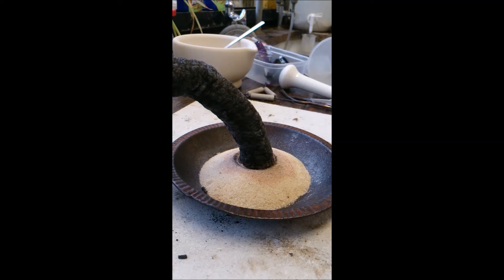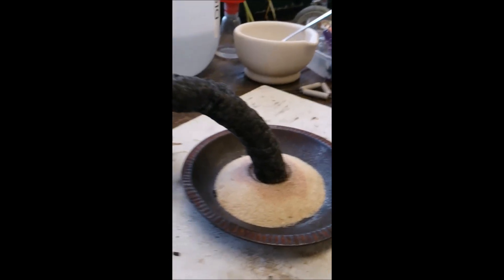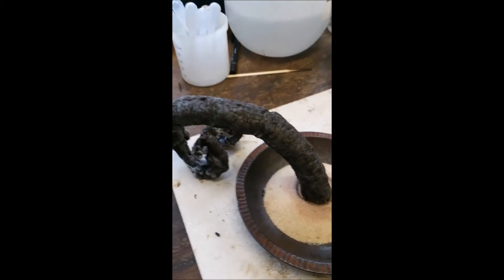There we are, that is the end. Run out of things to burn. You can see quite nicely how it's done and all curled itself up.